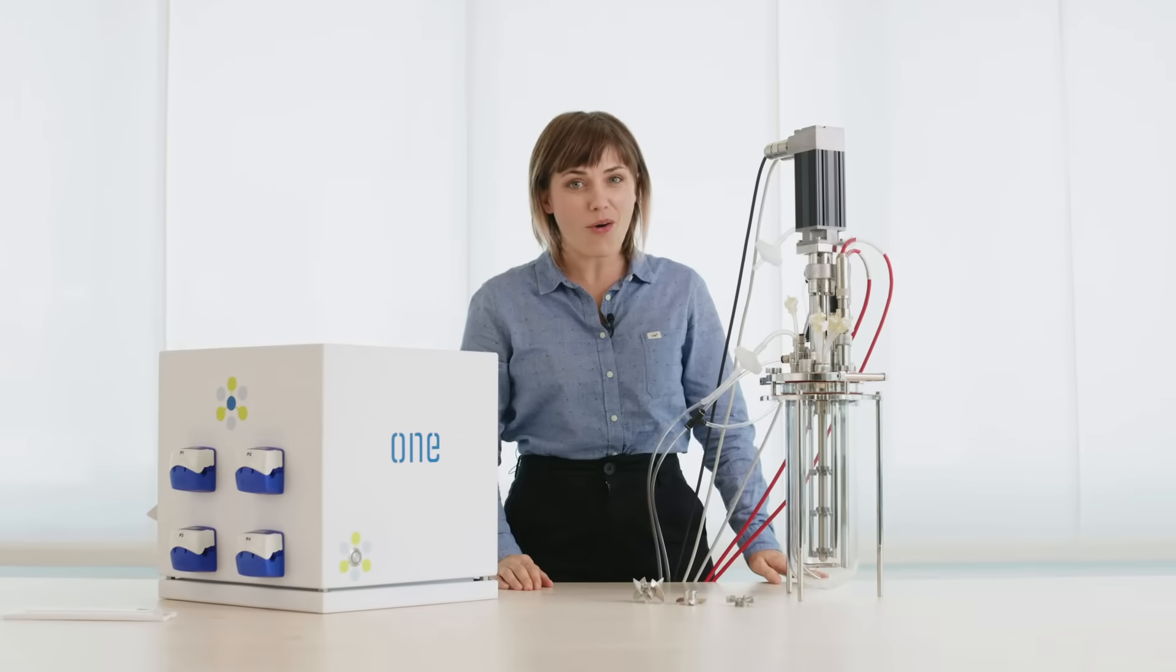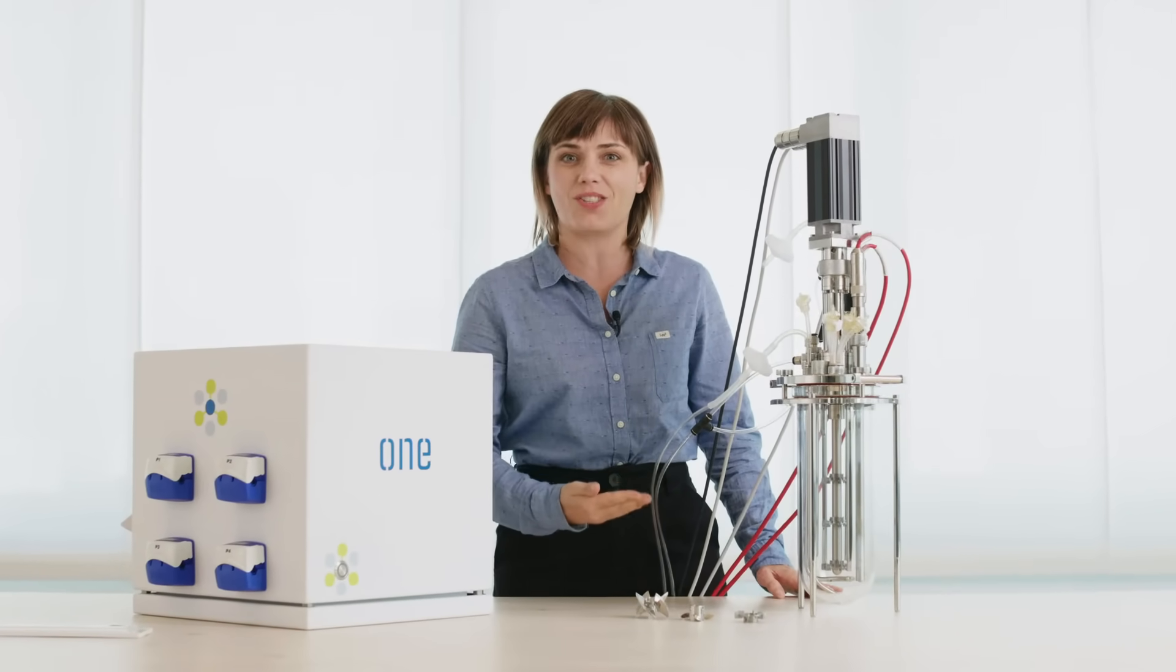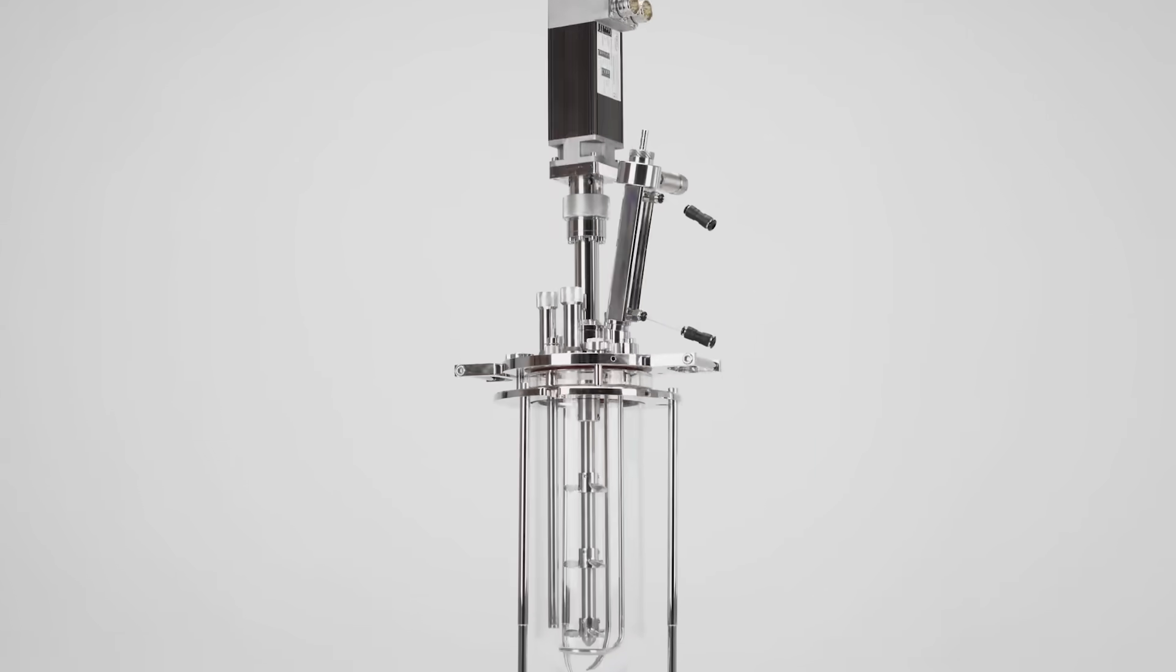Here we go. We have a two liter total volume single wall vessel designed for aerobic and anaerobic cultivations or fermentations.